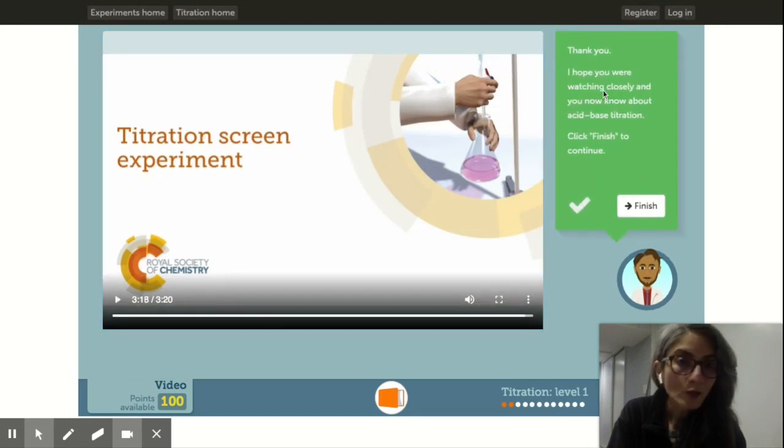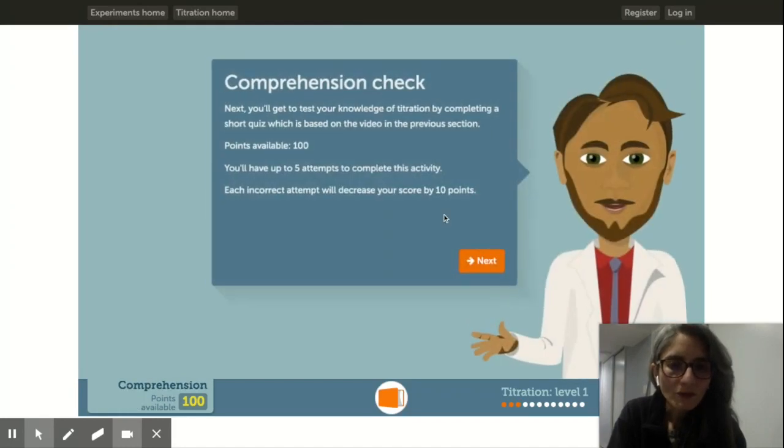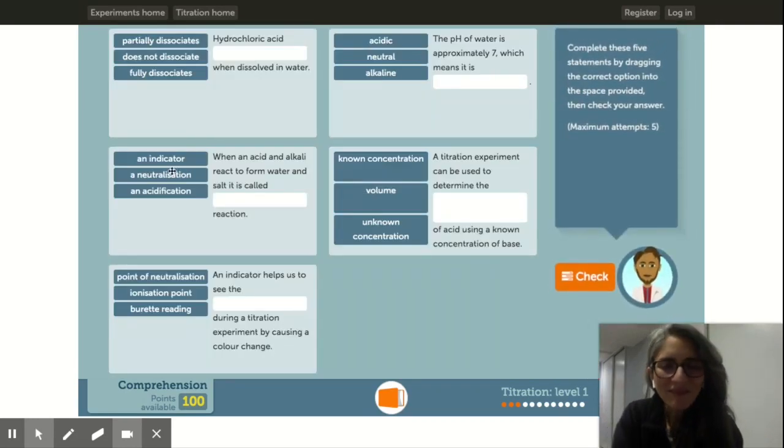it'll say, okay, I hope you paid attention. It's going to give you a short quiz, a comprehension check, right? In which you're going to just drag whatever terms you think belong in this statement. And once you have it correct, you would just click on check and check your answers, okay?